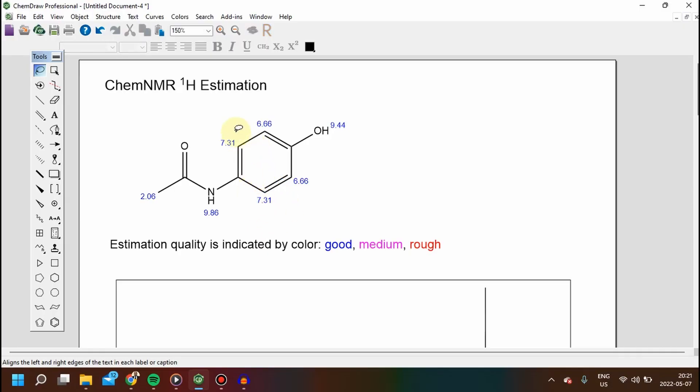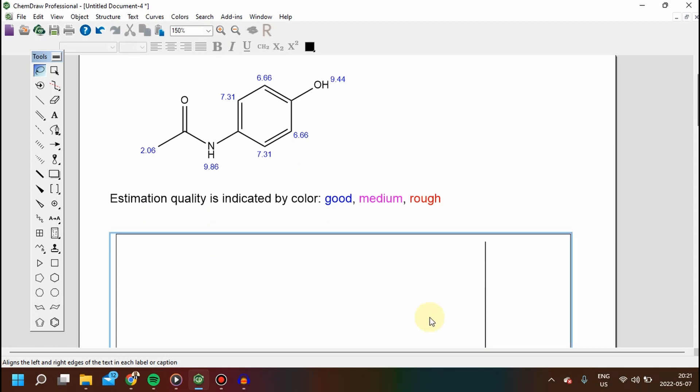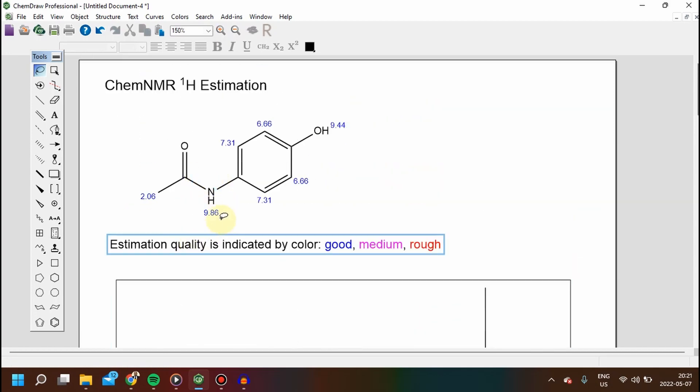From this side of the substituent, we have a methyl carbon bonded to a carbonyl carbon. The methyl protons are highly deshielded because the methyl carbon is connected to a carbonyl carbon which constantly draws electrons from this environment.